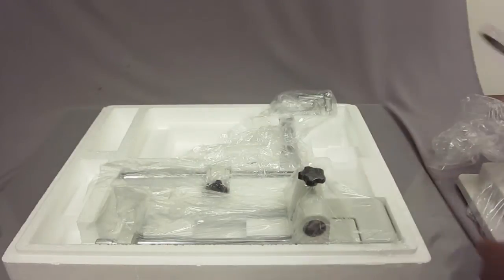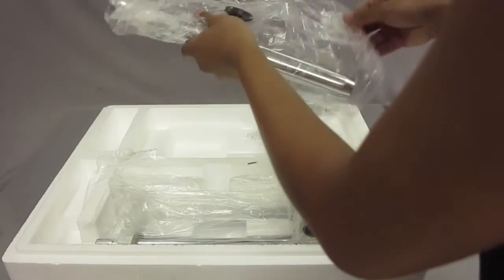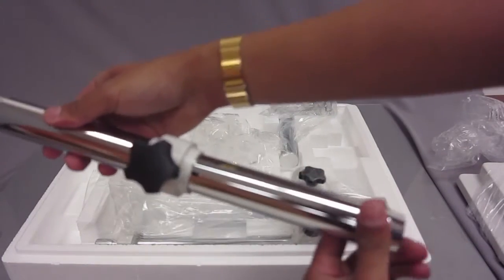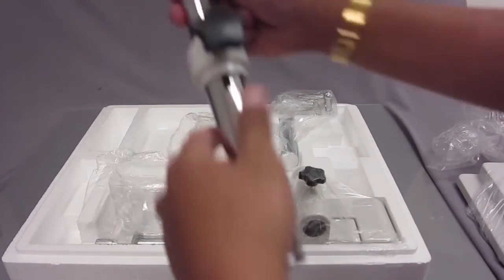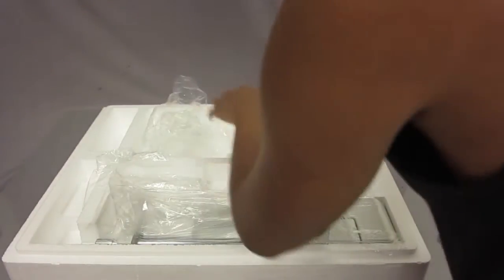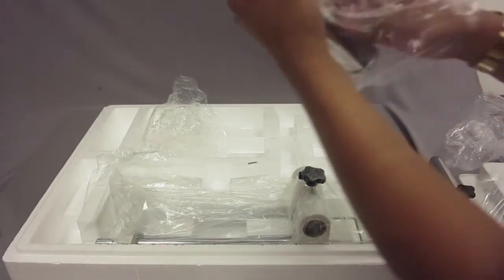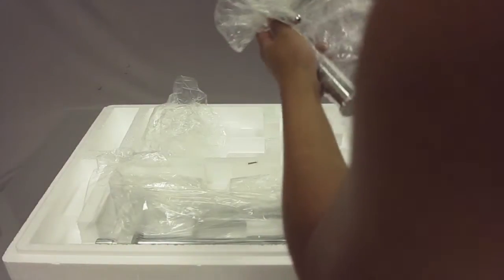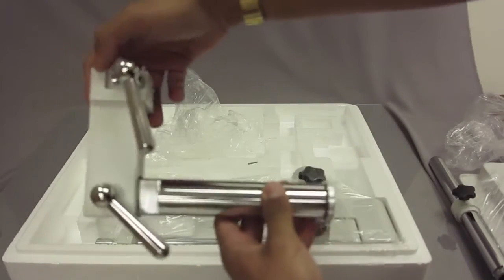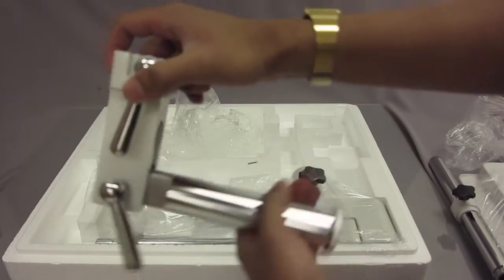Another part is the pole that goes into the stand — you would just go ahead and screw this into the bottom of the base. There's also another part that is what you use to secure the head and the focusing rack, and I'll show you how this goes together in a bit.